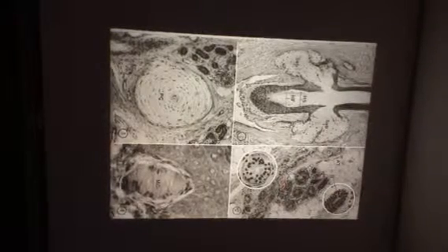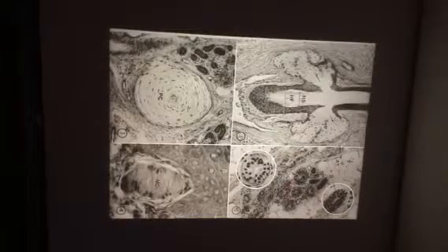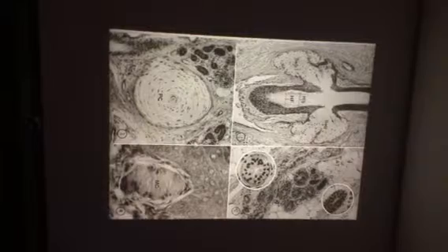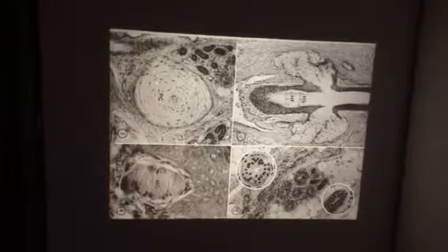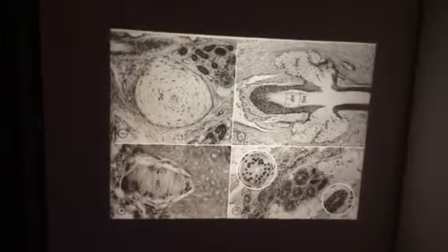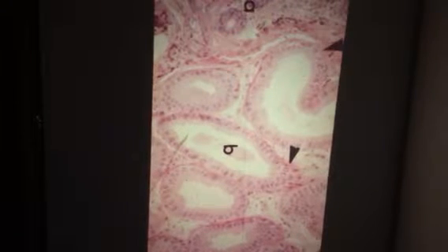Specifically, this comes from the integument as well. Yeah, eccrine sweat glands, apocrine sweat glands. And that thing right there, the Pacinian corpuscle. Can't miss that. Okay, what is this thing right here? Node of Ranvier. I will either use this slide or perhaps one of the slides that are stained with H and E. But very distinct, not too hard to identify. And this is also taken from the integument.